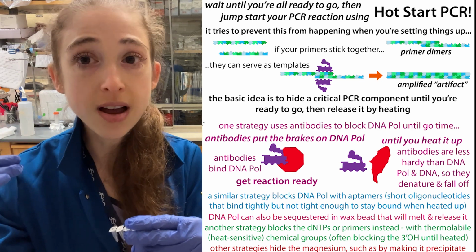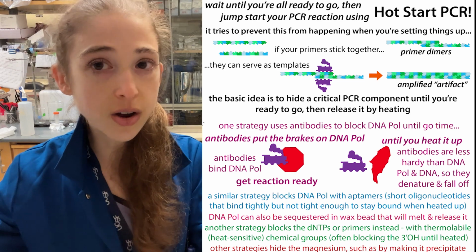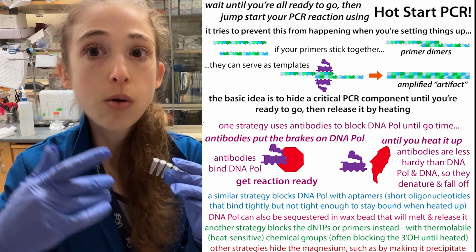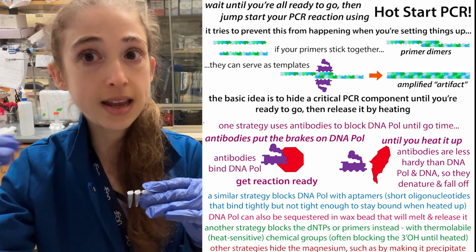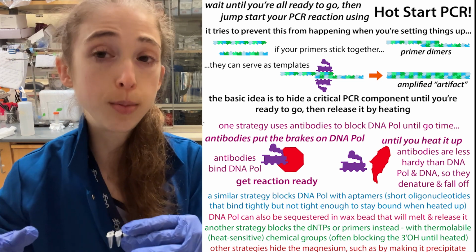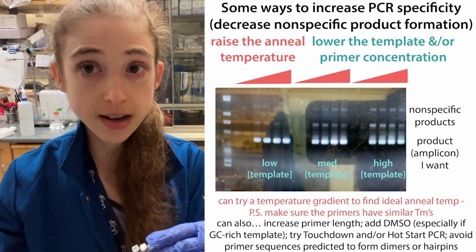Now the polymerase becomes activated, and you can get your products going and all that stuff, but you don't have to worry about having those lower temperatures where you have the primers binding to those non-specific sites and the polymerase being active at the same time. So hot start PCR is really helpful for that. Okay, so that was things that we're dealing with the temperature.